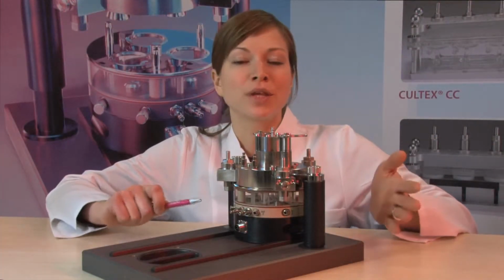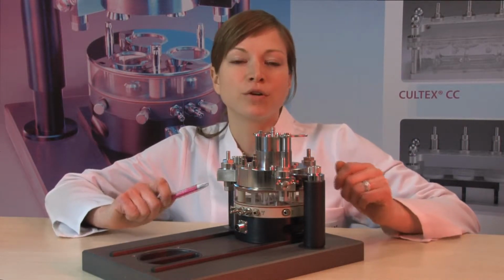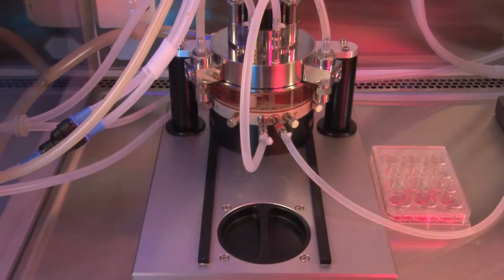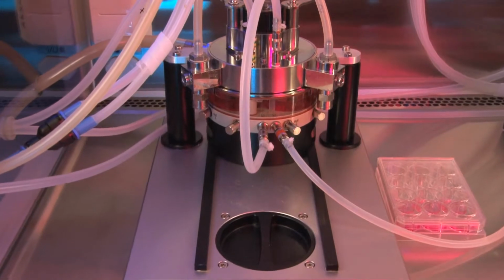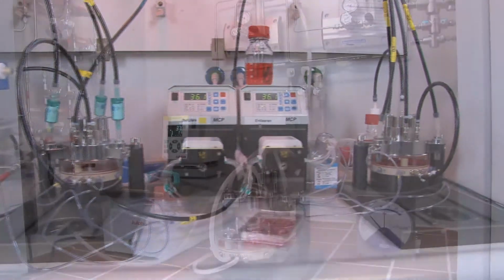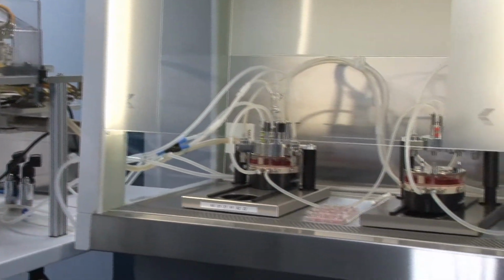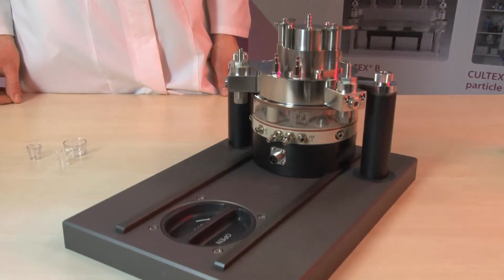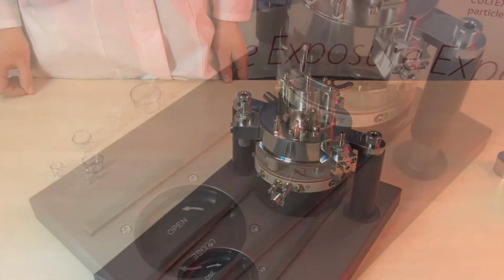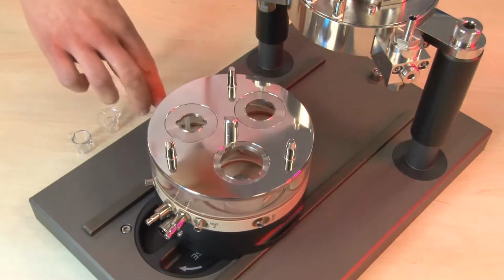CULTEX Laboratories would like to present its new CULTEX Radial flow system, the CULTEX RFS. A compact and versatile system for the direct exposure of cells to airborne substances. The CULTEX RFS distinguishes itself by its versatility for many different experimental requirements. Perform in-vitro toxicology analysis on cells from the respiratory tract, or even on bacteria, using a modified Ames test.